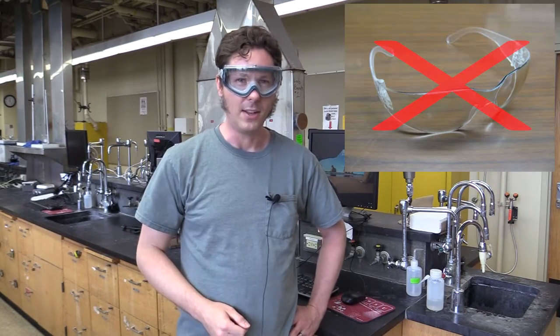Along with the proper clothing, you also have to keep a pair of goggles on whenever you're in lab. These have to be goggles and not safety glasses. This is because if you're splashed from the top or sides, goggles will protect your eyes, but glasses won't. When I say you have to keep your goggles on at all times, I mean even if you're done experimenting and cleaning up. Some of the glassware is a little bit tricky, and if you're not careful, it might get chemicals up into your face. Another reason to keep your goggles on is if the person across from you gets careless, they might splash you with whatever they're working with.